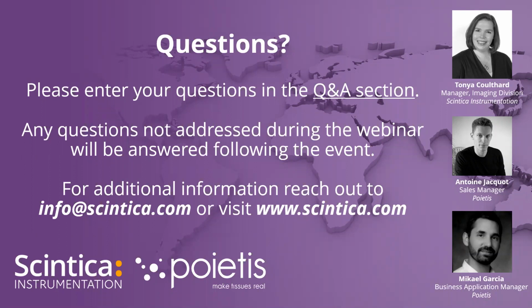So, questions coming back to how the printed tissues have been used in the past. For example, have they been used for drug testing, and have any of the disease models which have been printed been used to screen drug candidates, for example? Oh yeah, absolutely. I don't know if that person was with us during the part on liver tissues. That was an illustration of that. So basically, yes, bioprinted tissues can be used for a bunch of applications, and one of them is toxicology, drug screening, and so on. Great.